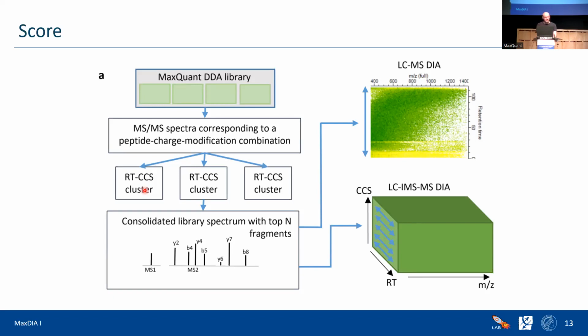And these you exactly don't want to average, because as you can imagine, if you have the same peptide occurring at early retention time and at late retention time and you average these two, you might get a nice average spectrum, but the retention time is completely nonsensical, because it would be some number in the middle of the two configurations, which has nothing to do with either of them. So averaging these would not be a good idea.